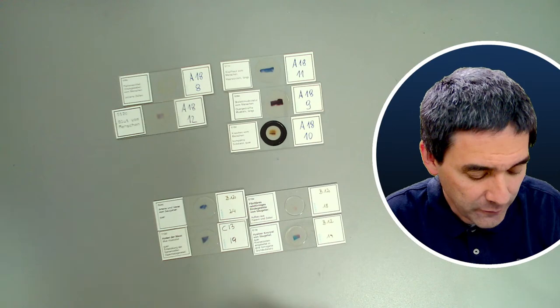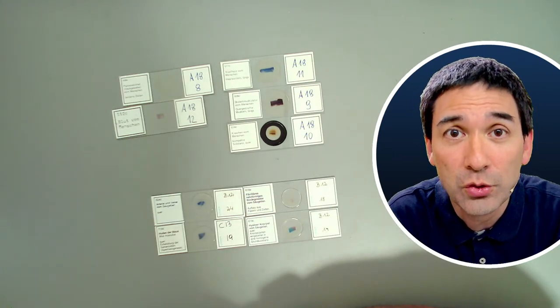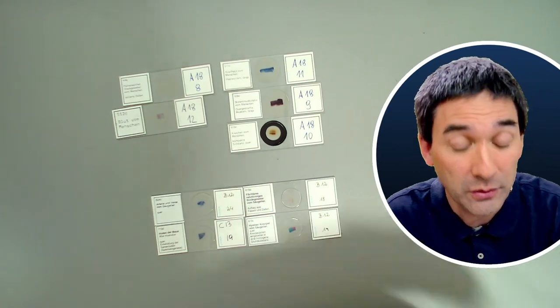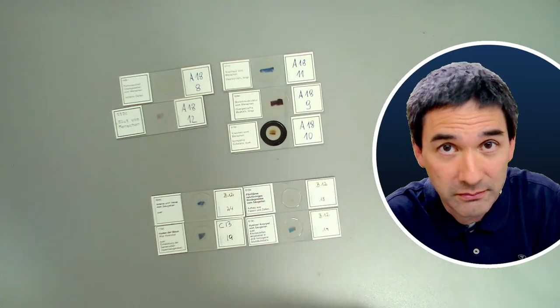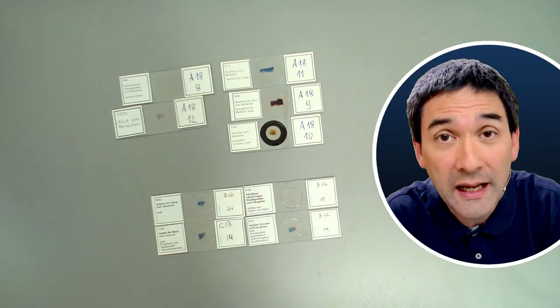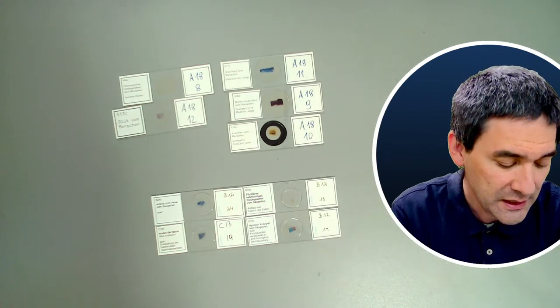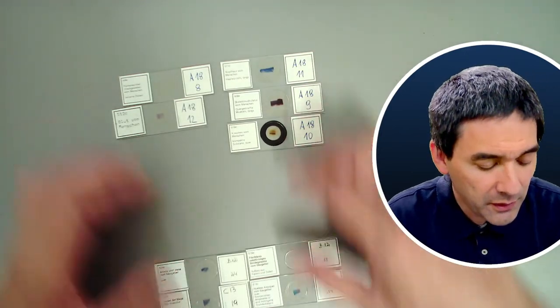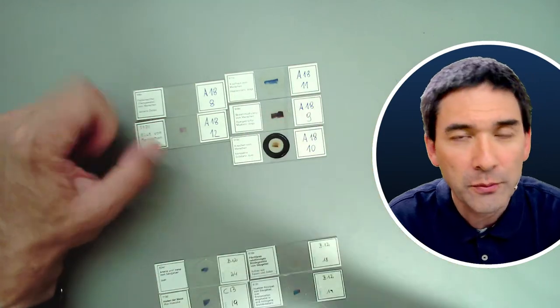The thing is the following, if you want to compare tissue between, let's say, humans and other mammals, on that level it all looks the same. So it really doesn't make a huge difference whether you're looking at the blood or the muscle of a human being or of a cow or a pig or whatever, dog or cat. It all looks the same, because on that level the tissue is very similar. So for this reason it doesn't make a huge difference. But those 5 slides are actually labeled that they are from a human being.